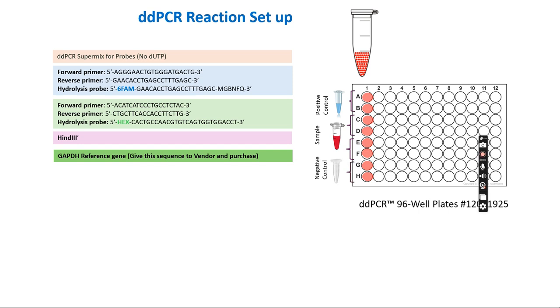And then the last one is your negative control. So for the negative control, you will use just buffer. Remember that in the negative control, you also have your reference gene. So in all of my experiments, I have a reference gene. So the negative control has reference genes and buffer. Samples have reference genes and sample. Sample means the testing sample, and the positive control means positive control VSVG and also reference gene.